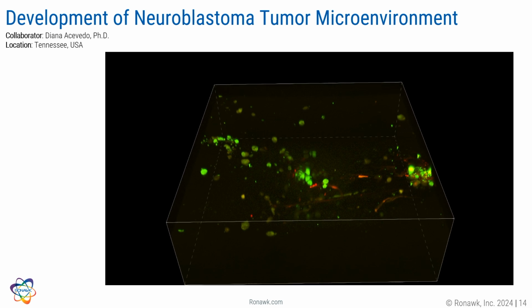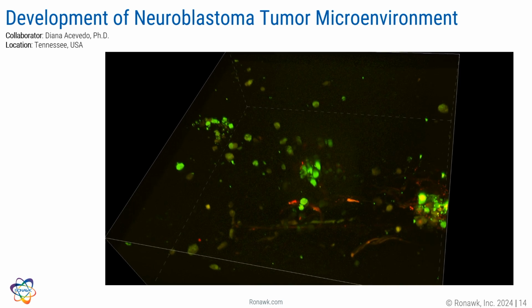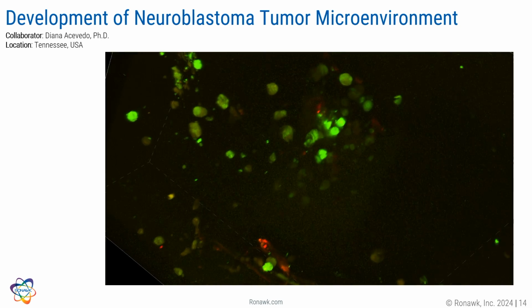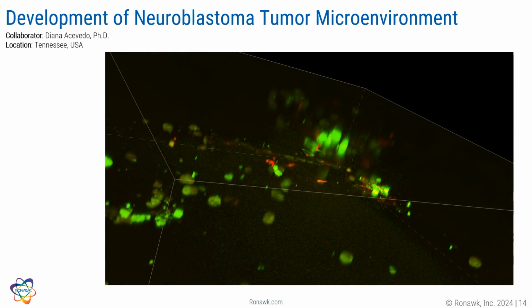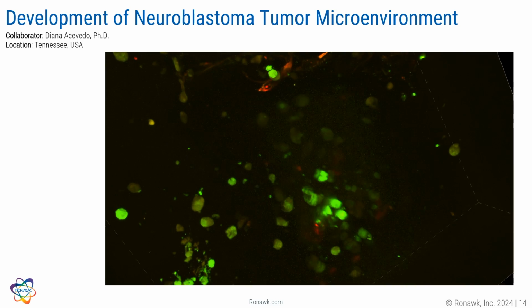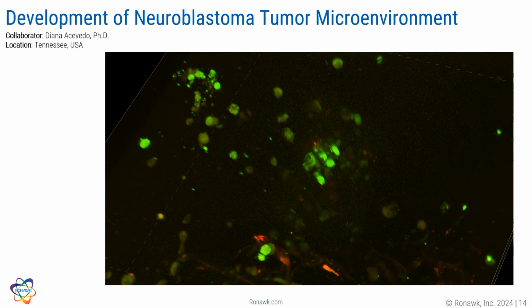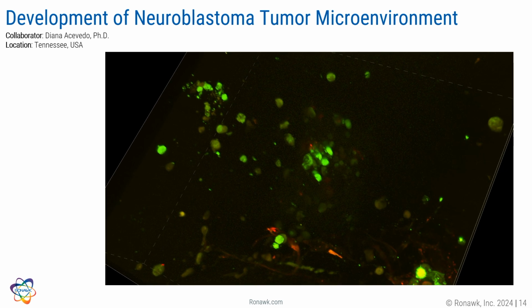So you can see that the cells are actually interacting with each other inside of those pores. And we did some more sectioning of that, and we can see that even in the center of that block, the cells are still interacting, forming their own little niches.